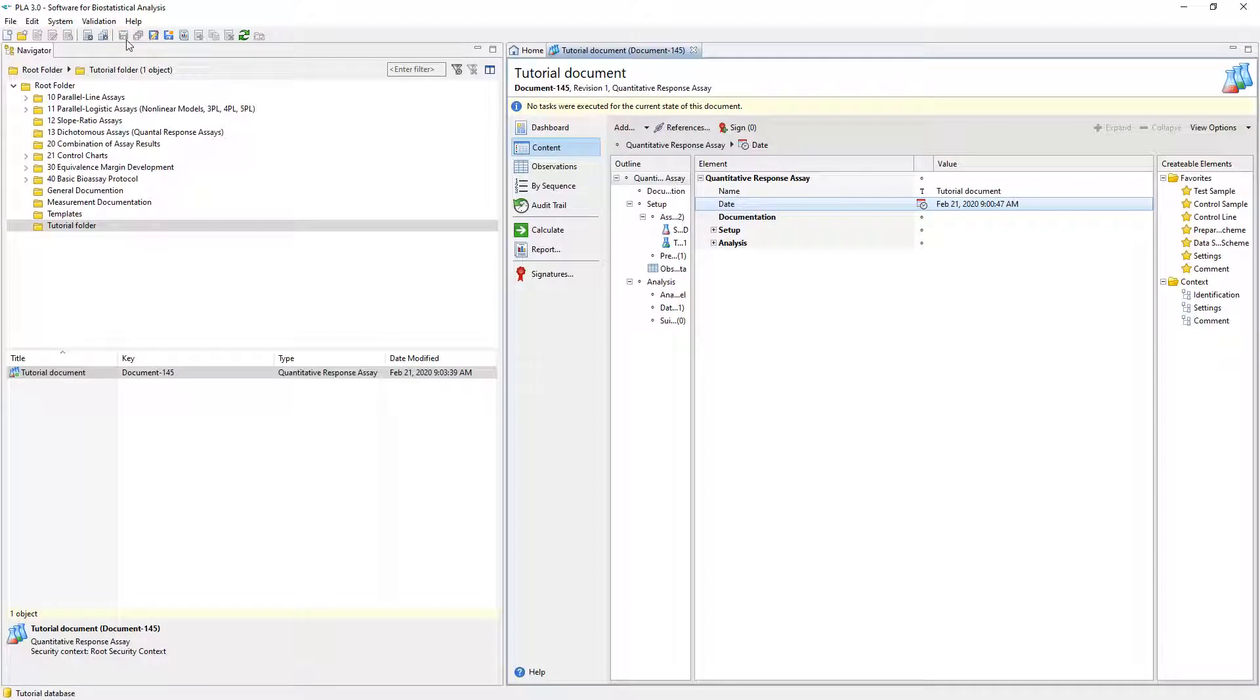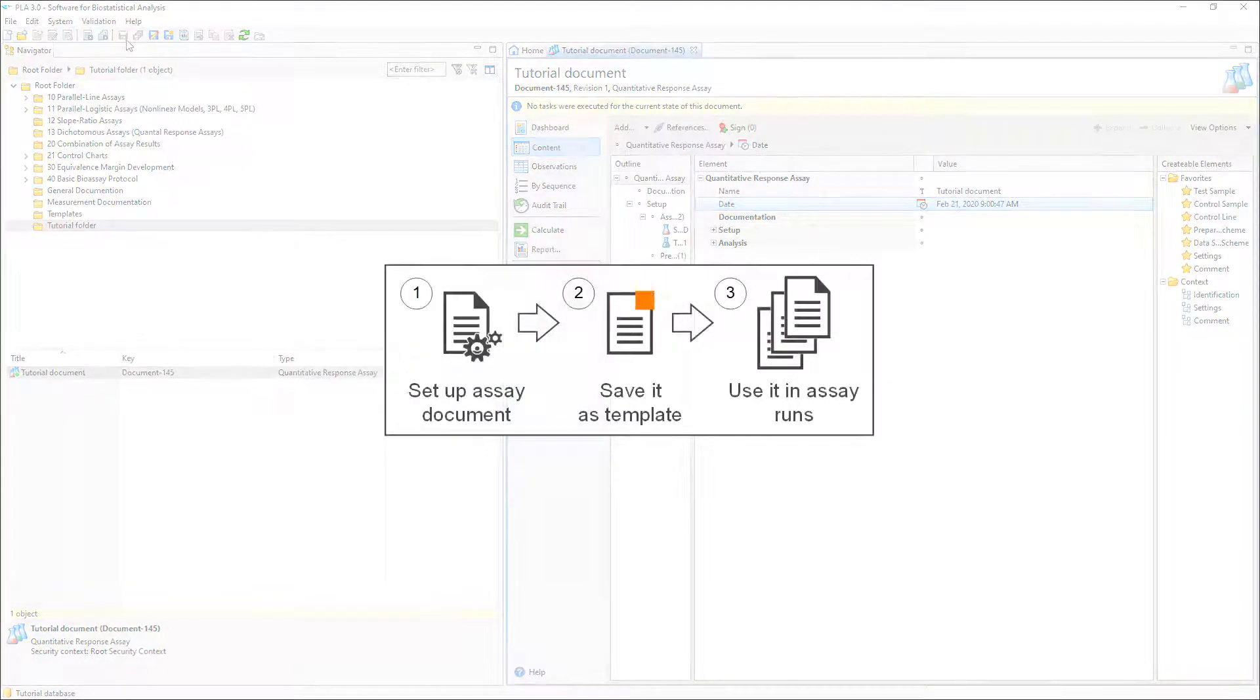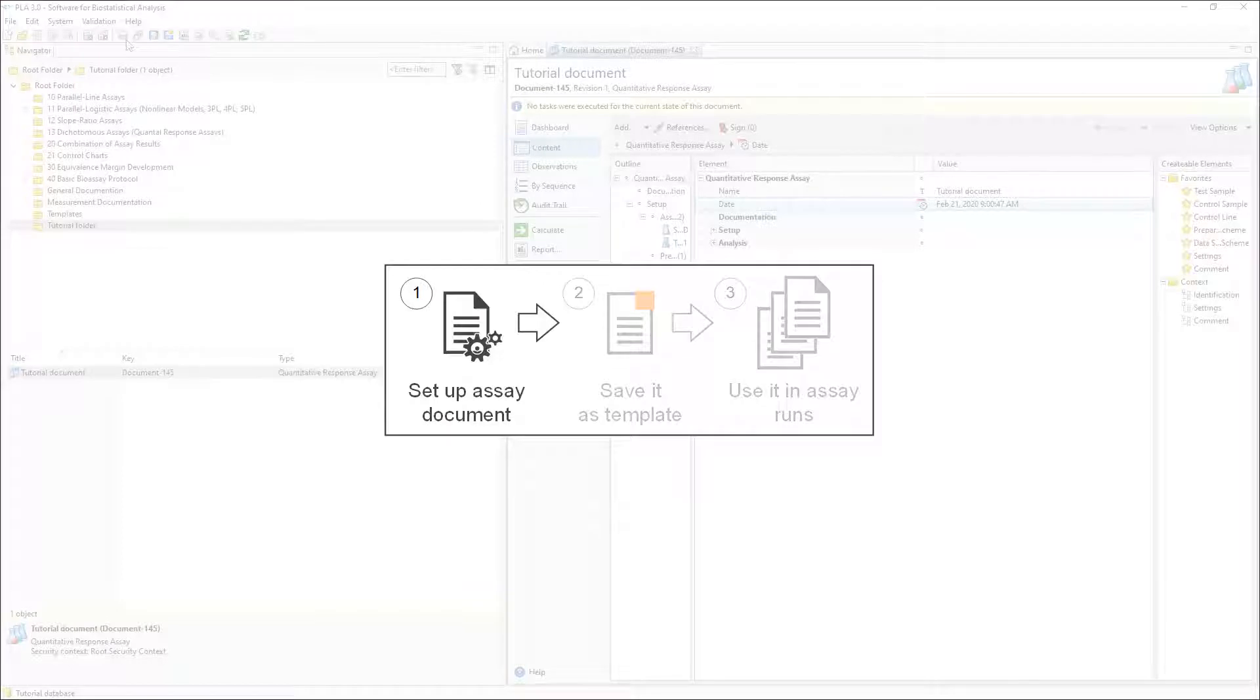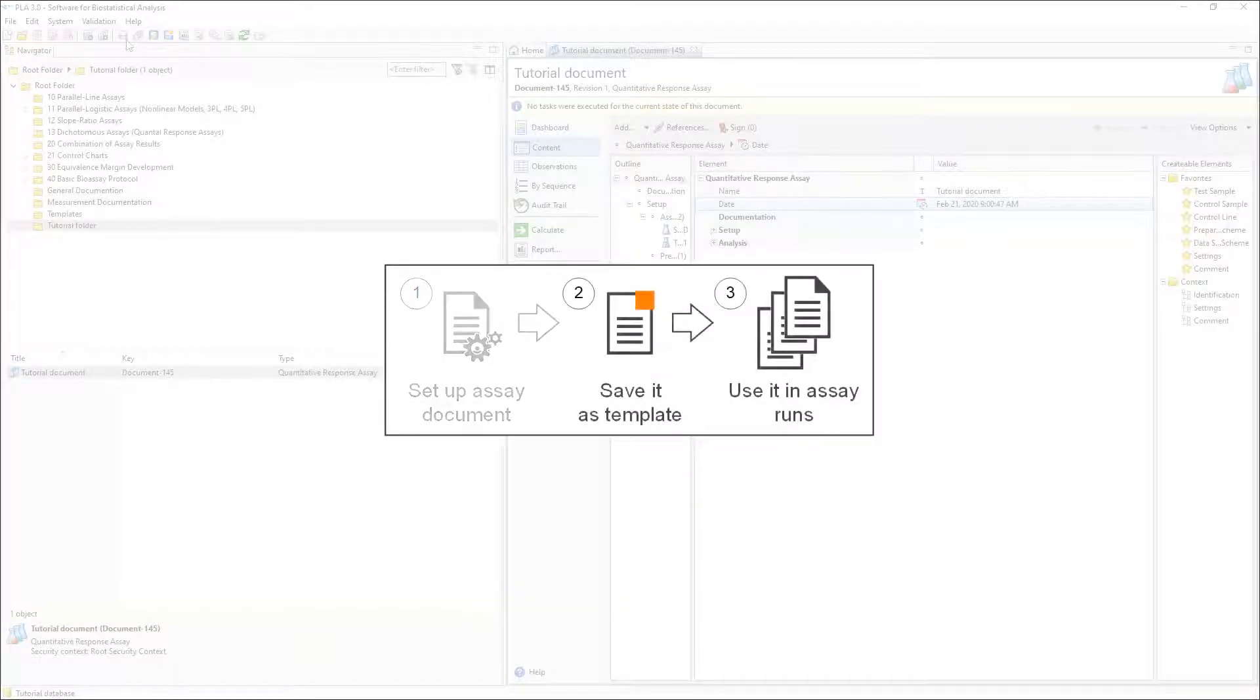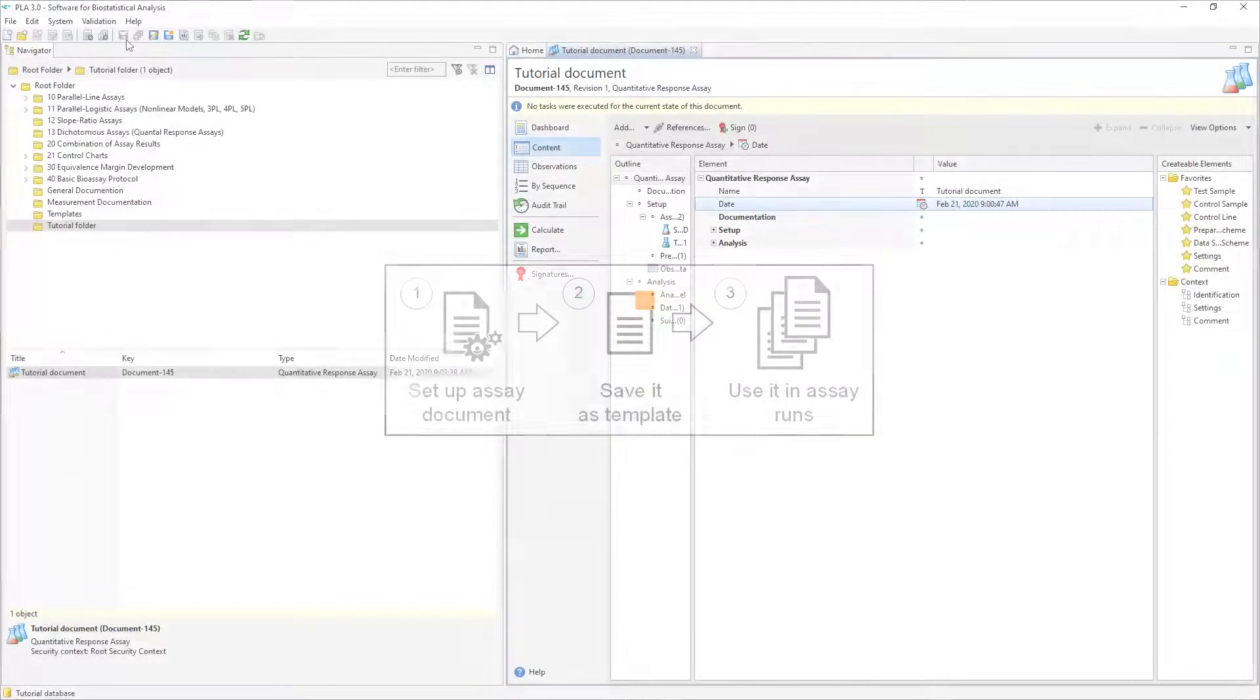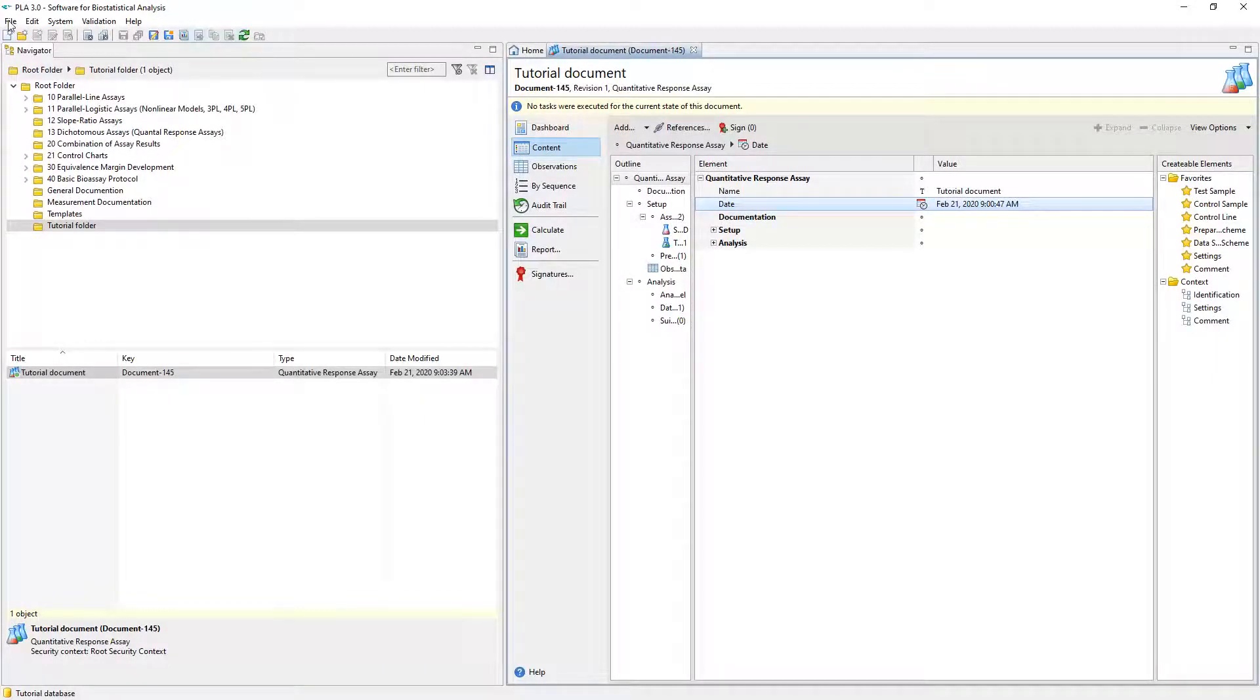You can also use this document as a template for the creation of further documents. All documents you create based on templates will inherit the initial values you defined in the original document. If you work with biological assays, for example, you may set up an assay document during development. Then you want to use this assay document for several assay runs. To do this, simply create a template from the assay document via the Save as Template option in the main toolbar or the file menu.